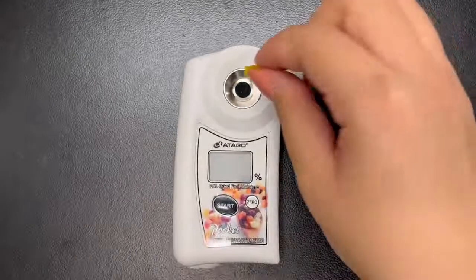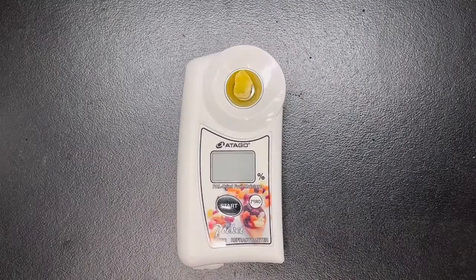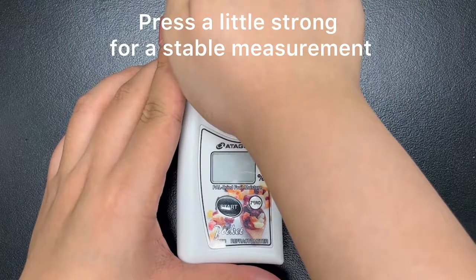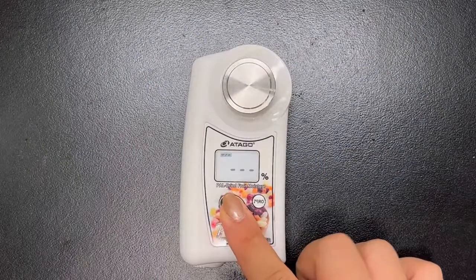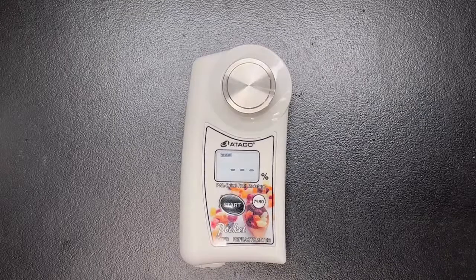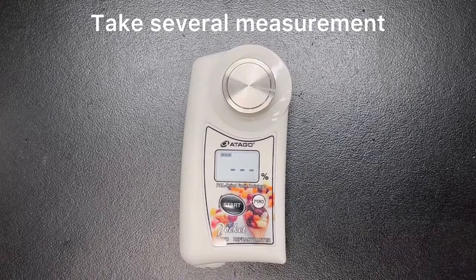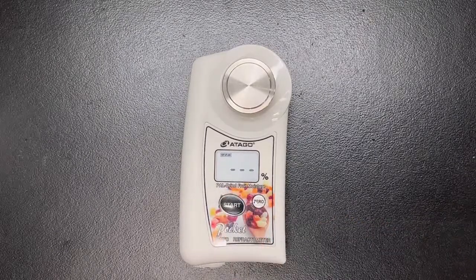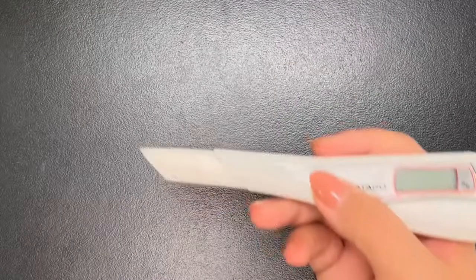With pineapple and other dried fruits, cut the dried fruit and make sure to measure the inside of the fruit. When using the PAL, there is an additional accessory called the Magic — press the dried fruit firmly onto the sample stage to get a stable measurement, as if the fruit is not properly on the stage it won't measure well. As you can see here, the pineapple reads 20.3%. Take several measurements to make sure the value is stable.